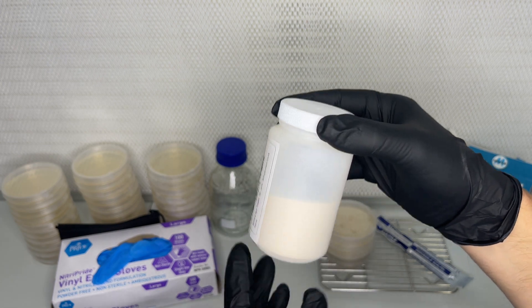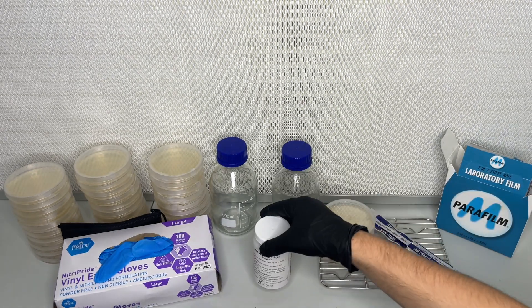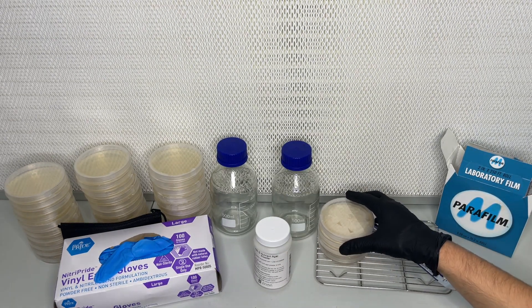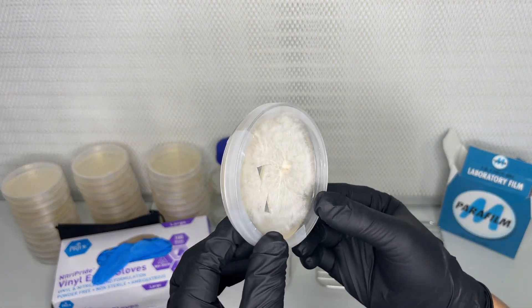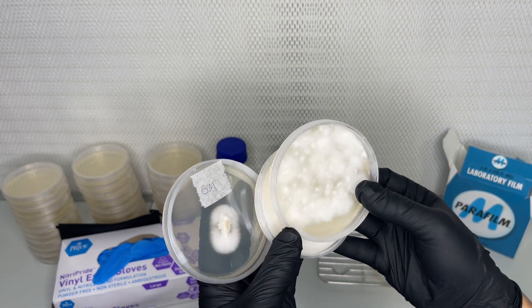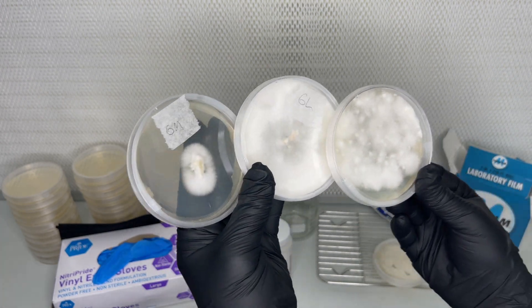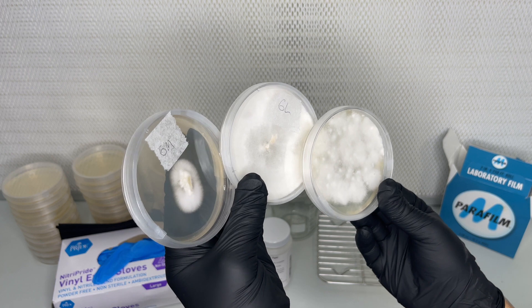To start off, this nutrient agar powder makes the best agar plates that I've ever used, and I've had a lot of problems using other brands. They are great for germinating spores, cloning fresh mushrooms, and storing your mushroom cultures.